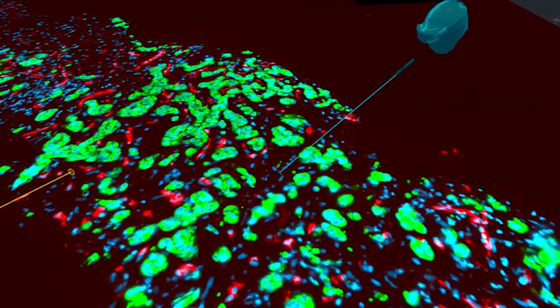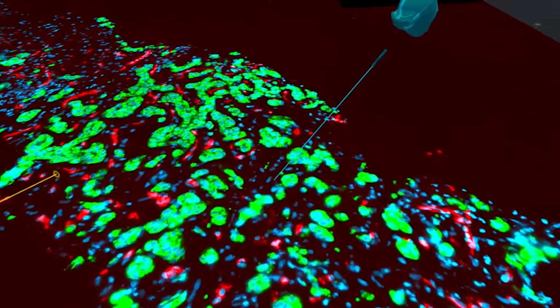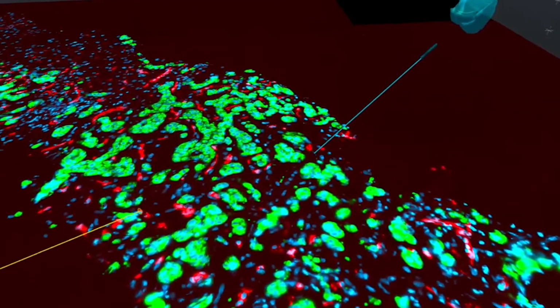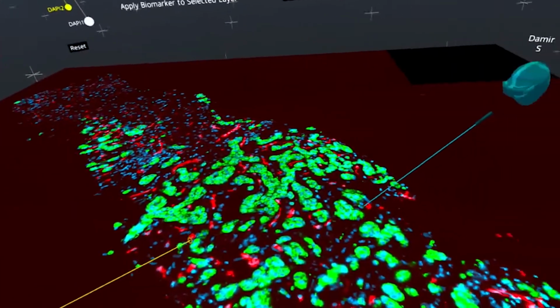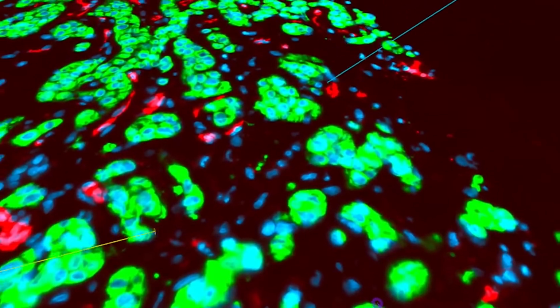What you see primarily, for the cells that are not colored with any other color, is just the cell nucleus. Surrounding it, for some of the cells, you'll see the cell body, which is colored in some cases with a green dye, an indicator of tumor cells.